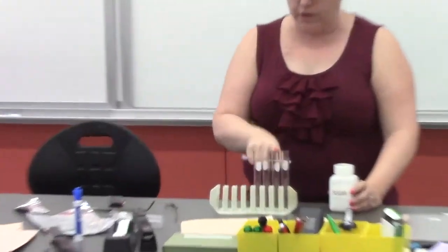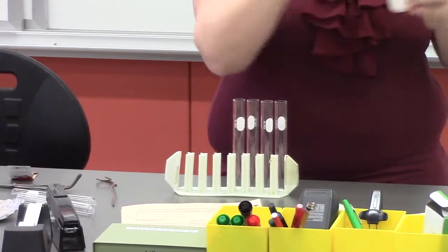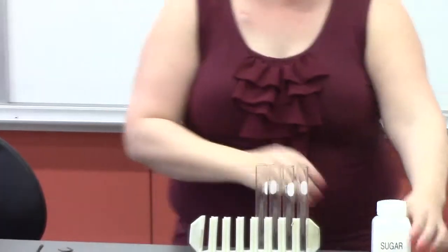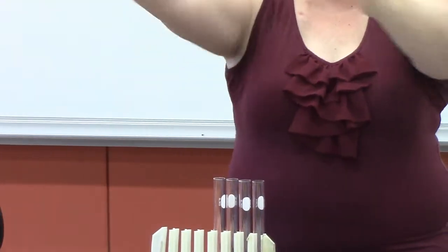So salt in the first one, then sugar, then wax, then the copper sulfate. So again, open it up, take your scoop, put it in your test tube, close it, put the bottle down. So that means you're going to have your test tubes of water, you're going to bring it over to the side tables, put your solids in, then bring it back to your station. You don't want to do what I did, which is grab the bottle and the scoop off this table and bring it back to your station.